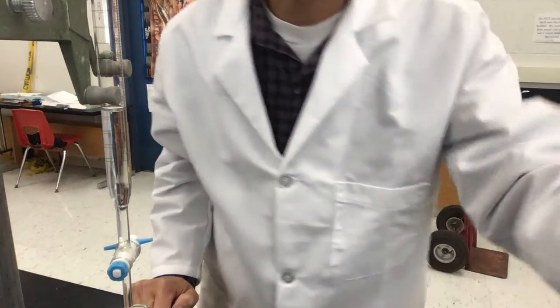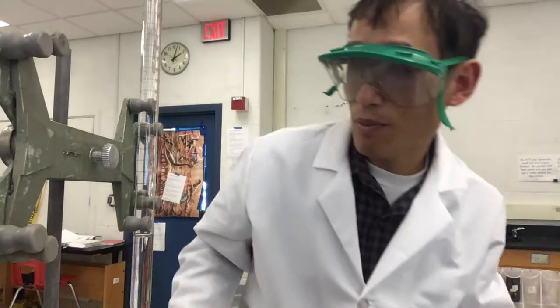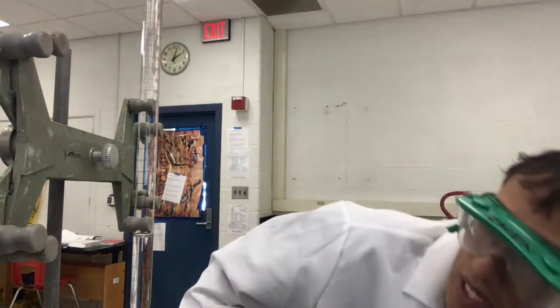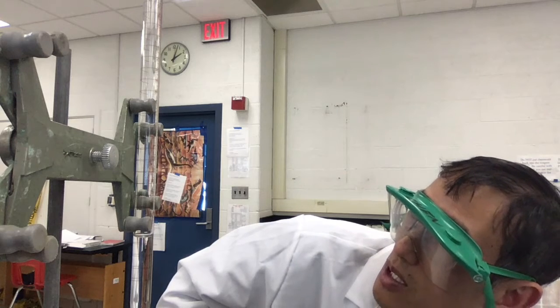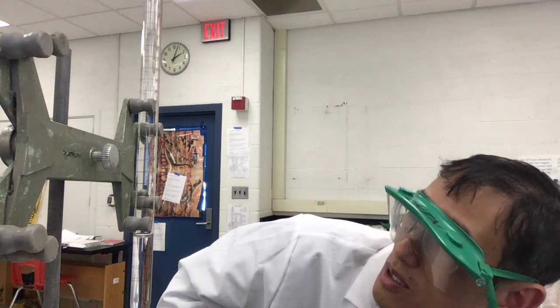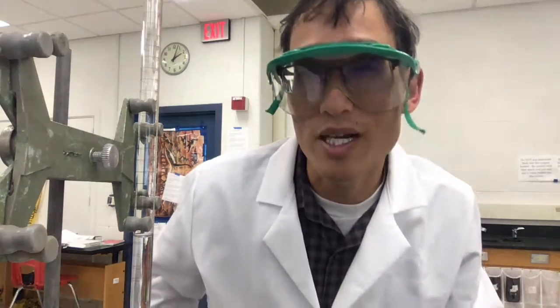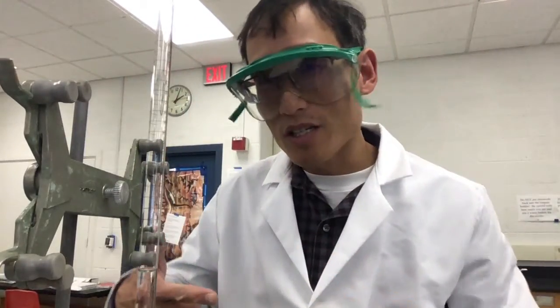So 93.20, I subtract from my first starting point, which was 62.90. That's like 30 milliliters. So I know that it's going to take about 30 milliliters to do this.